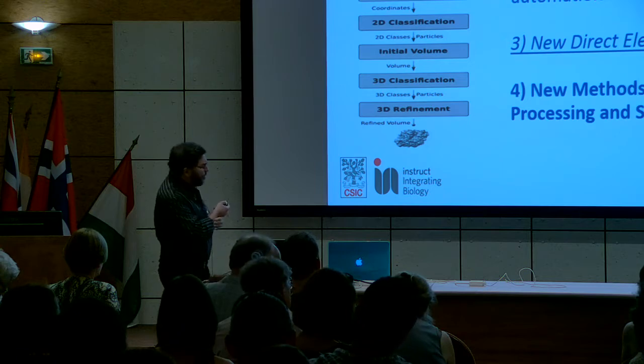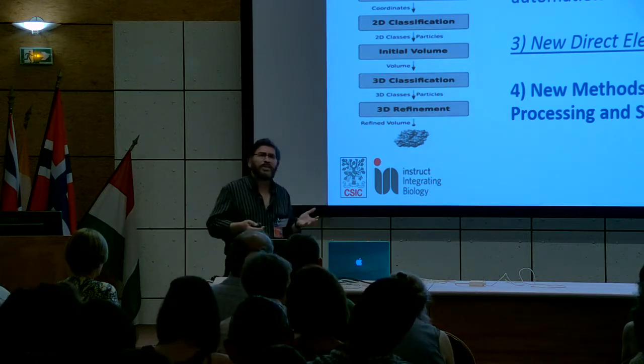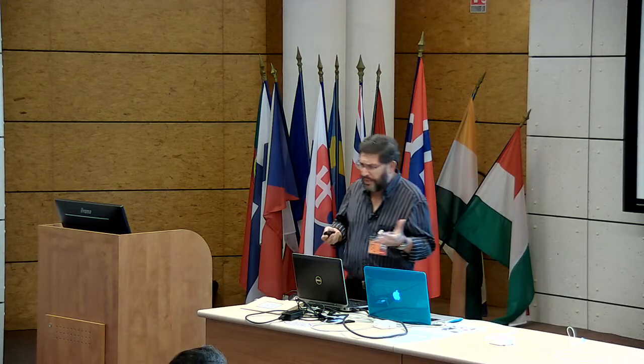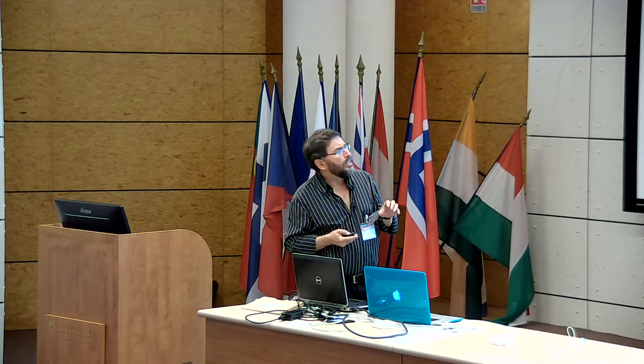However, I should also point out that we have developed, as a field, a number of new image processing approaches that have enabled us to do conformational sorting. I mean, to follow flexibility from the images, and to be able to fully relate three-dimensional orientation in the different specimens.